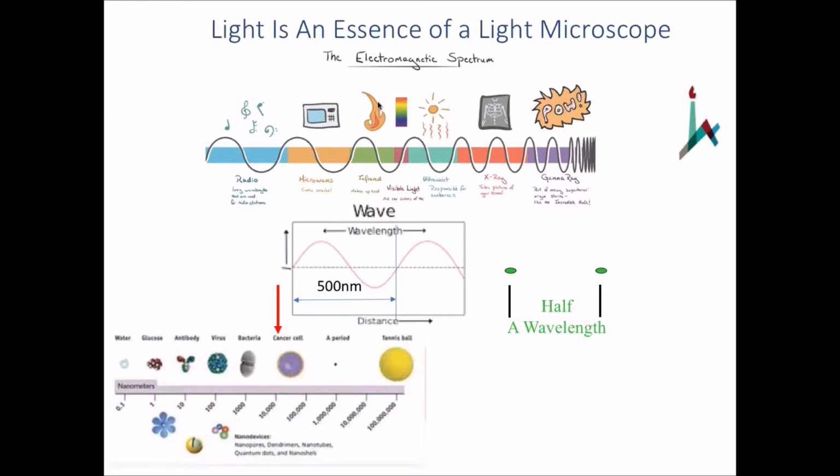You can also go to the longer wavelength regimes, okay, and they have their own interesting aspects. For example, a terahertz can give you information that you would not be able to get with the X-rays or the visible light regime.